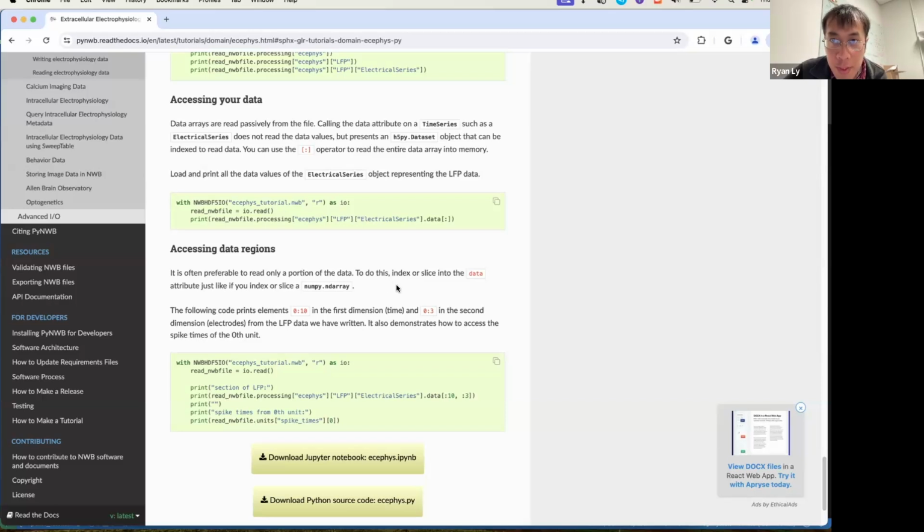Okay, I'll now pass it off to Ben to cover much the same material, but using MatNWB instead. And I'll take any questions as we transition.